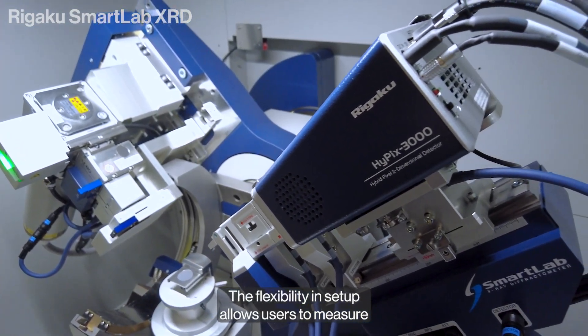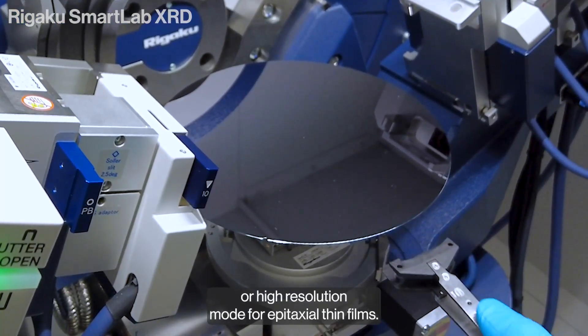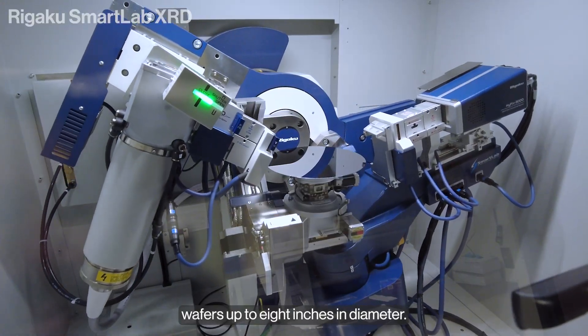The flexibility and setup allows users to measure in Standard Resolution mode for polycrystalline materials or High Resolution mode for epitaxial thin films. The large sample area can accommodate wafers up to 8 inches in diameter.